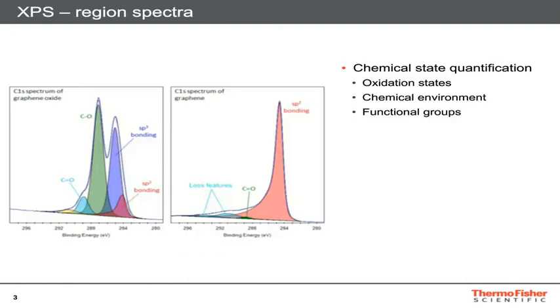Here are examples of typical spectra we achieve with XPS for these types of materials, graphene on the right and graphene oxide on the left. Determining between these two compounds, and therefore the oxidation state, chemical environment, or presence of these other functional groups, can be achieved readily. However, determining the sp2 and sp3 bond content, and therefore the structure, can be difficult.